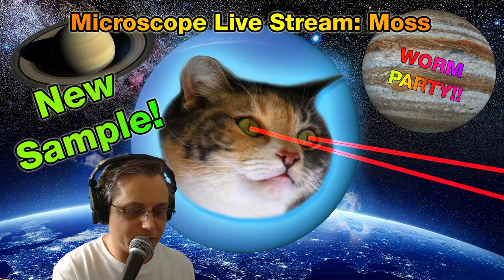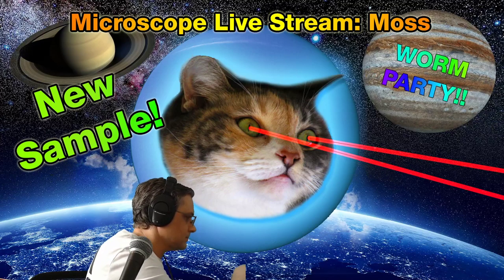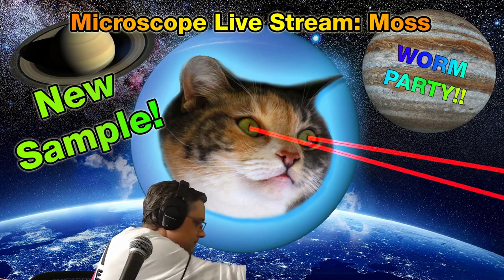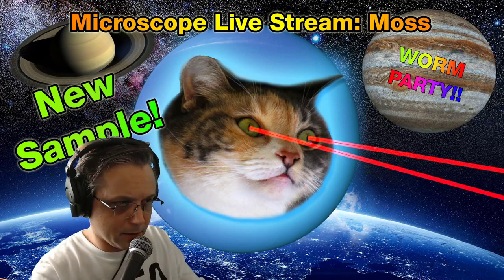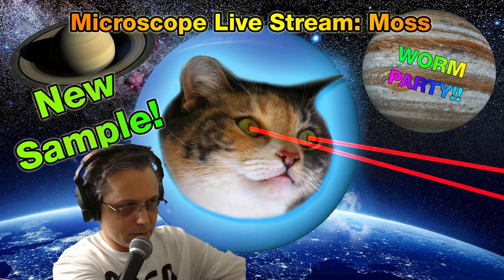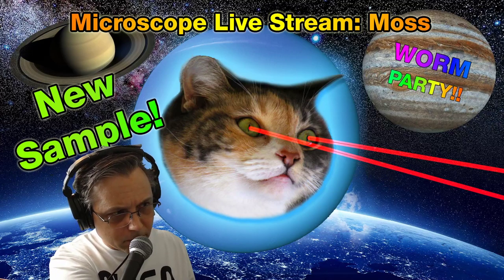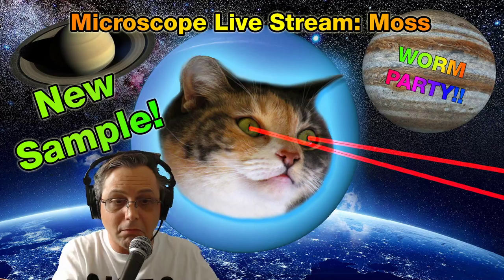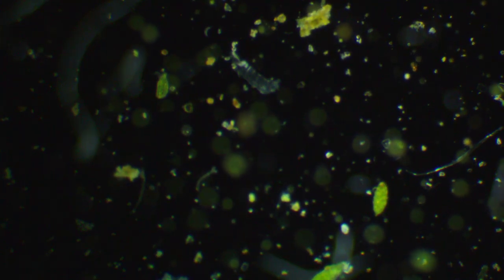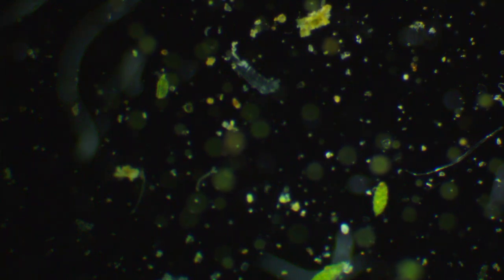That's about 4 drops. Moving the slide up to the microscope. Put the slide in place. Going up to the top of the drop. We'll see what we got in here. What's in here?